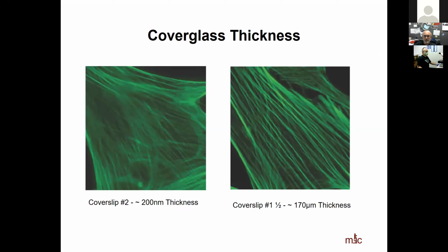So here is an example, an image taken with the correct cover glass for which the objective is designed, and then another similar sample where the wrong, too thick cover glass was used. And you lost a lot of resolution there.